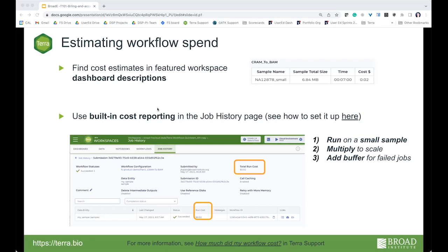Basically, you turn that on, and if you end up having some failed jobs, it will take all of the work that you've done successfully, and the next time you rerun your job, it'll start from there instead of starting from the beginning. So that's something to know about as you're getting started with Terra.